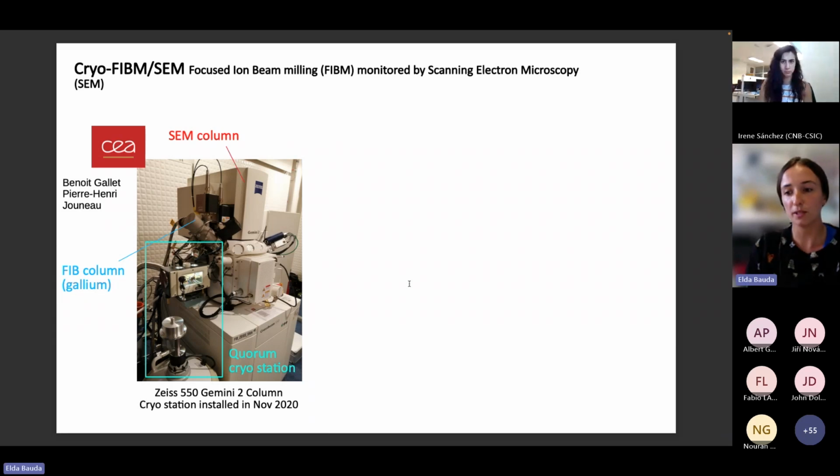This process was far from being straightforward because it was actually a lab mainly of material scientists, and there were few users actually doing cryo and biological applications. So the cryo-stage had some stability issues, and it took a really long time to be able to make the first lamella. It took me about 9 months to get the first lamella that could show nicely a spore. So at that point, I really needed to see how things are done in a facility and get expertise advice.